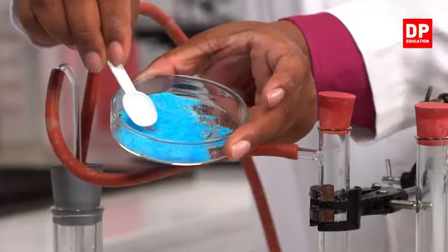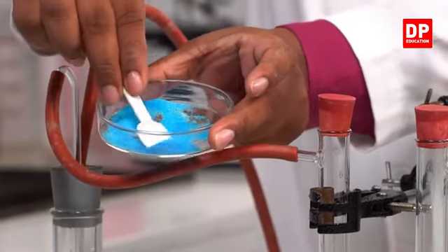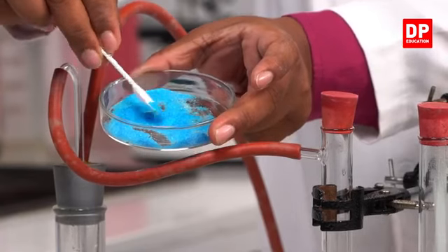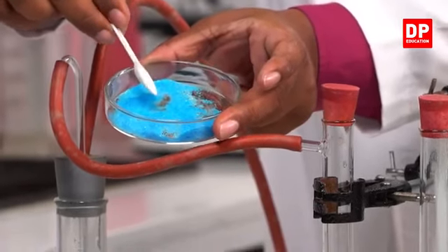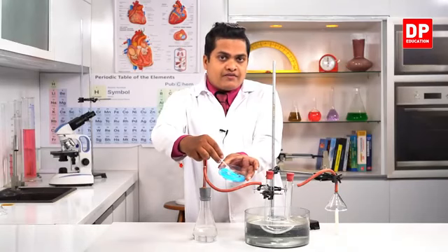See, this is usual copper sulfate. It's in blue color, right? Usual copper sulfate. This is hydrous. Hydrous means it contains or absorbs water. So this is hydrous copper sulfate.